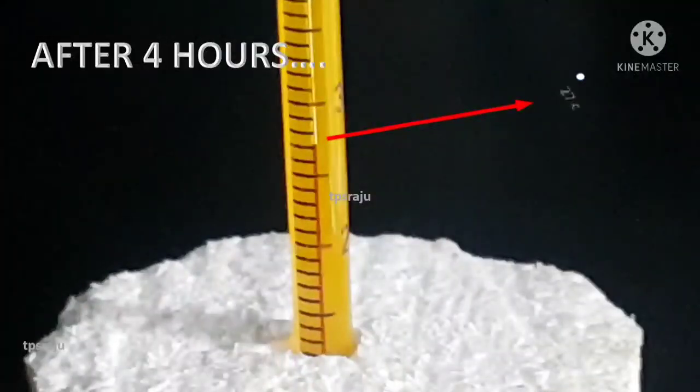After 4 hours, the temperature is 27 degrees centigrade. Here we observed that the temperature increased slowly.